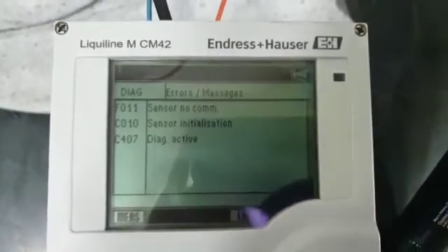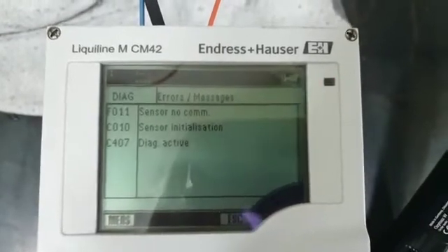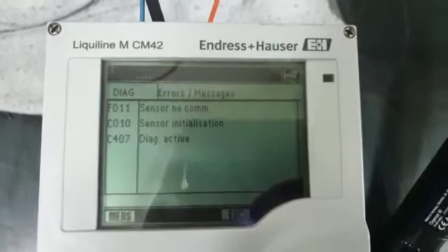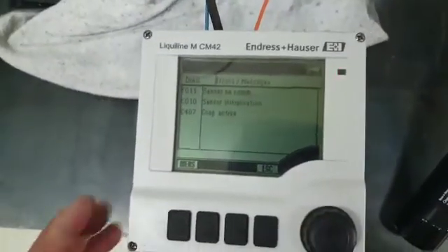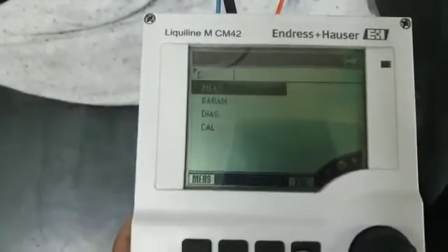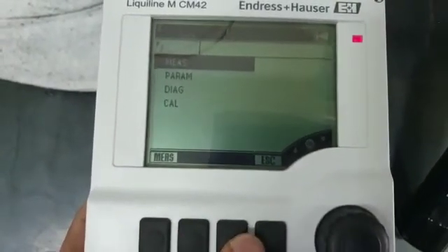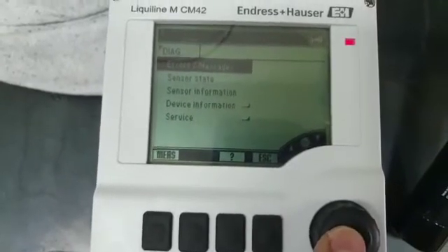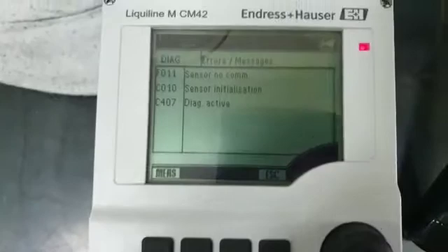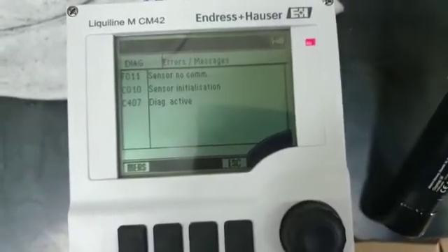It's not communicating at all and it is not initializing because this sensor has a problem. I'll escape it, then escape again, then diagnose again. Still no communication, and the red alarm is blinking. This alarm icon keeps appearing — it's not continuing. I have to remove it again.